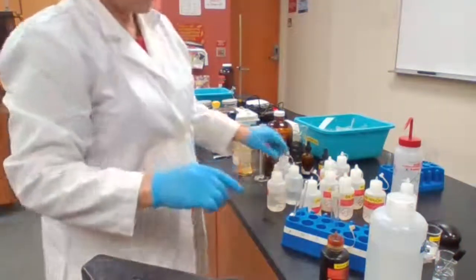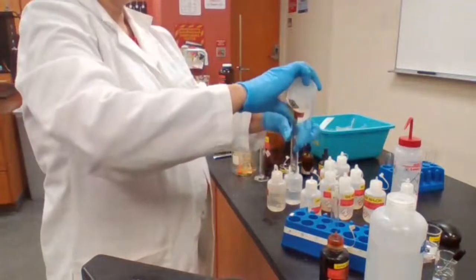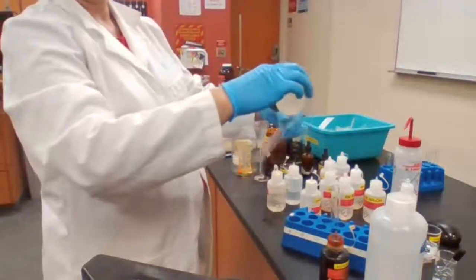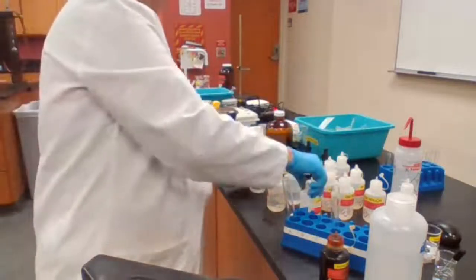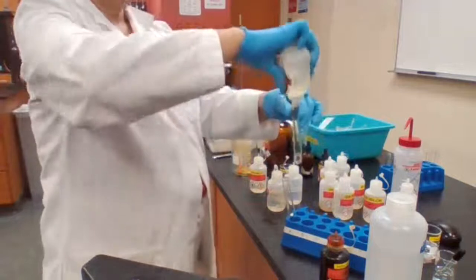And I'm going to add unknown A to the first test tube, and unknown D to the second test tube.